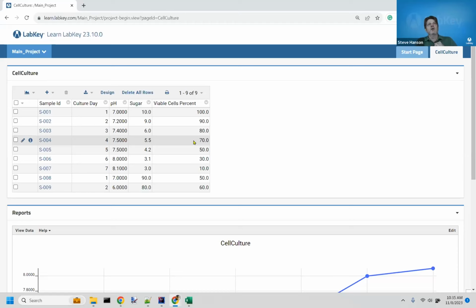By the way, I should say though, inside of Sample Manager, the UI around working with data grids and updating data online is much more advanced and does feel more like Excel. You can do things like drag downs and copy and paste and work with the grid that's online. It's really slick. It's really nice. If you want to see more of that, there's a great number of videos that Hannah did, and you just can't avoid that UI. It's everywhere whenever you work with Sample Manager. So it's not always as crude as it is in the server.